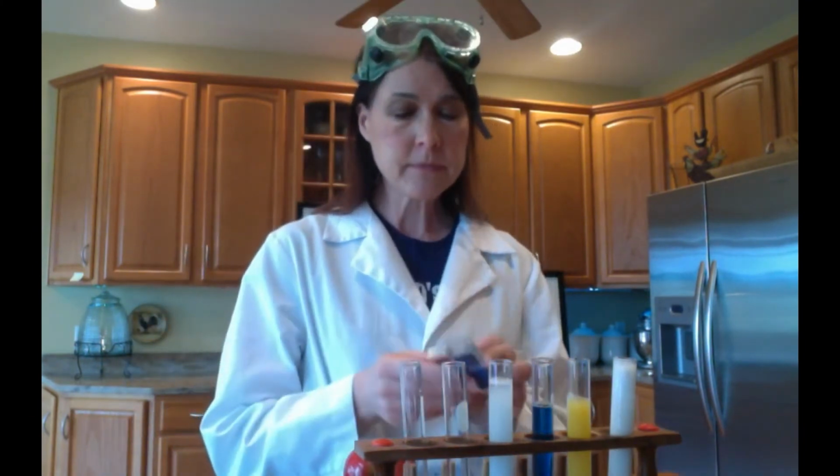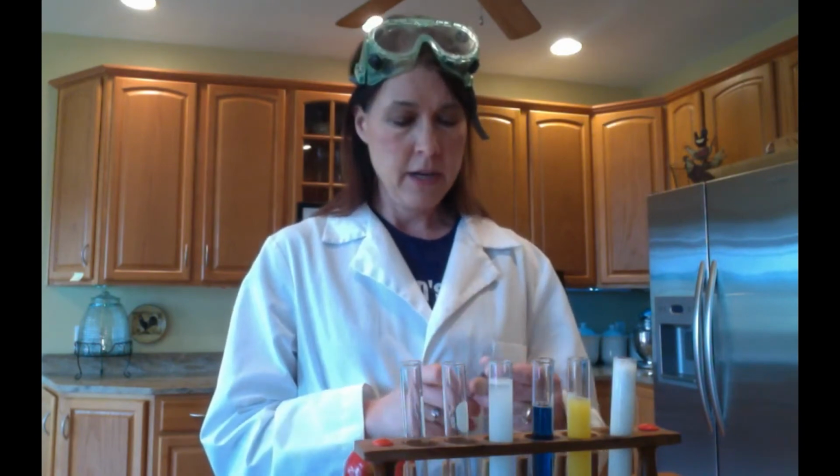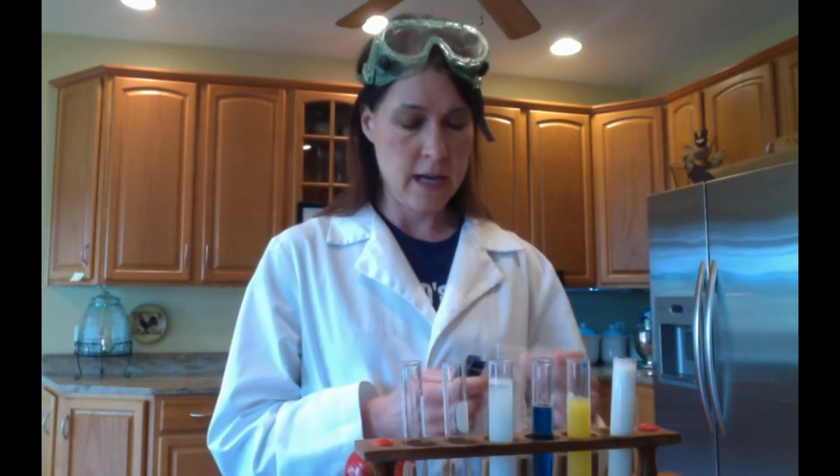Now let's go ahead and test that with litmus paper. We said that acids turn blue litmus paper red. Here's a fun fact. What really is litmus paper? Well, litmus paper is taken from lichens and put on filter paper.